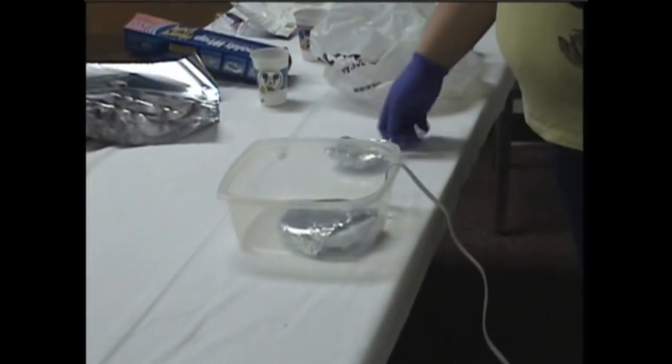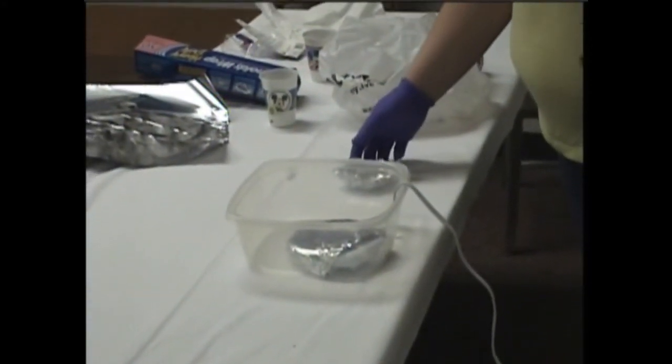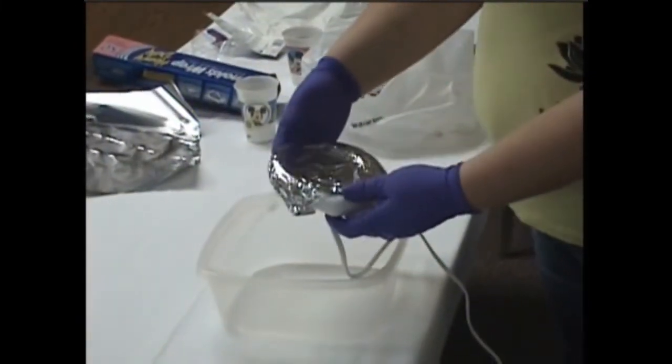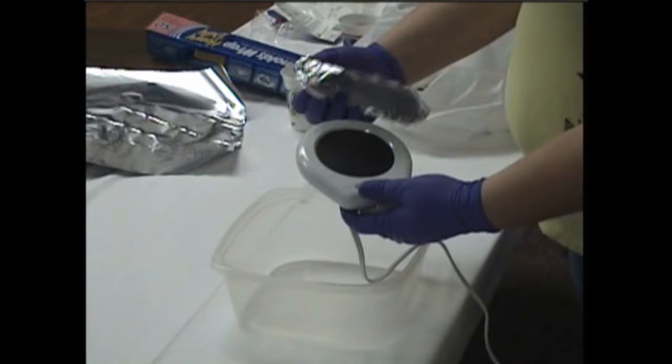To demonstrate how to develop fingerprints using superglue fuming technique, the first thing that we had to put in here was a low-level heat source. This is a candle warmer.